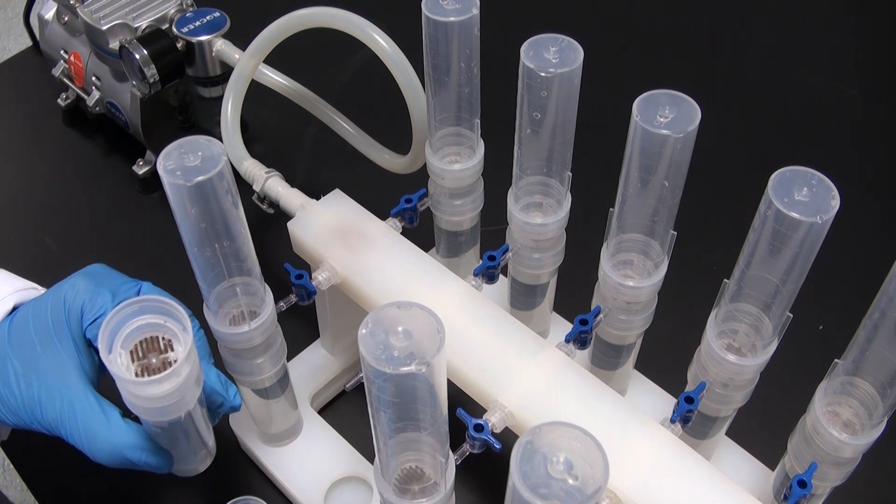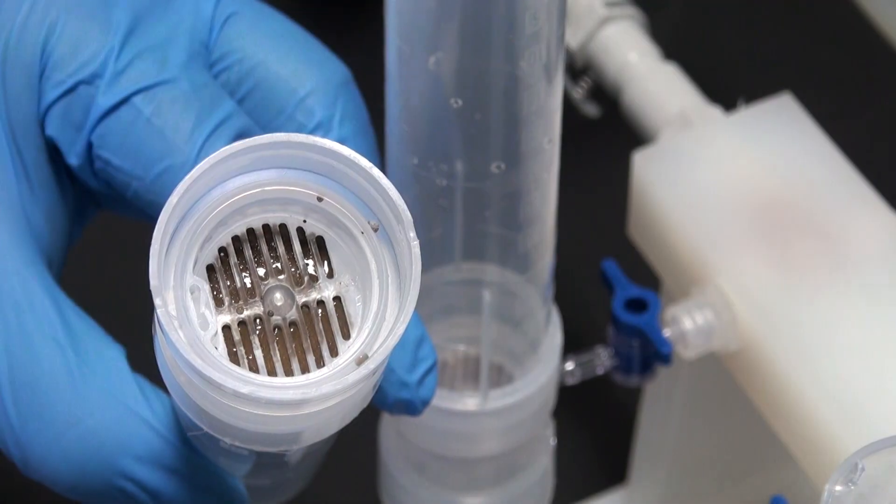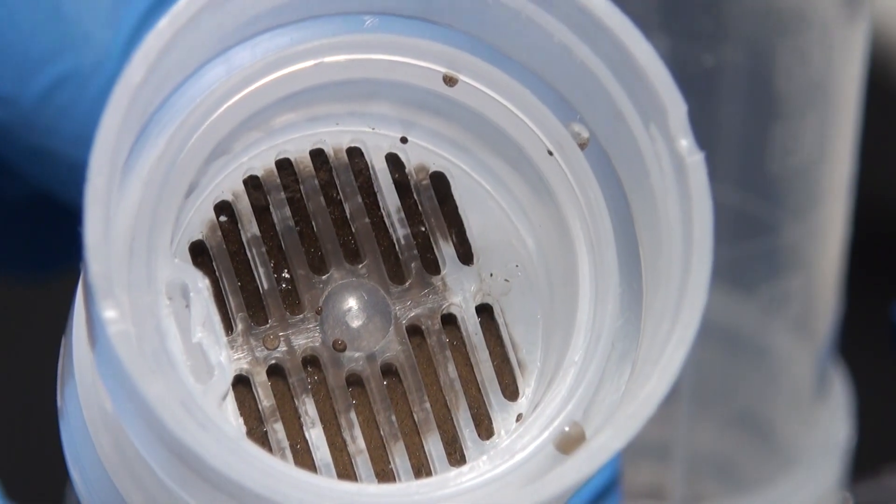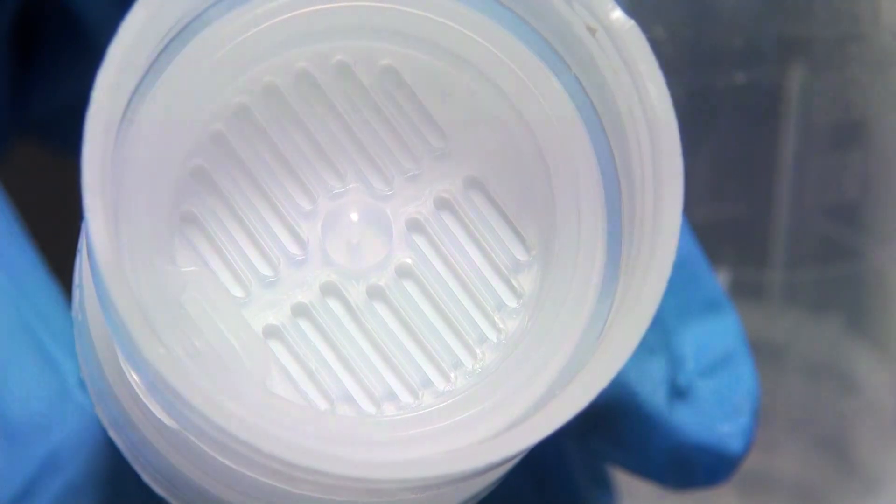Digifilters are available in 50 milliliter format and 100 milliliter format. The Digifilter is an effective, disposable, trace metal-free filtration process.